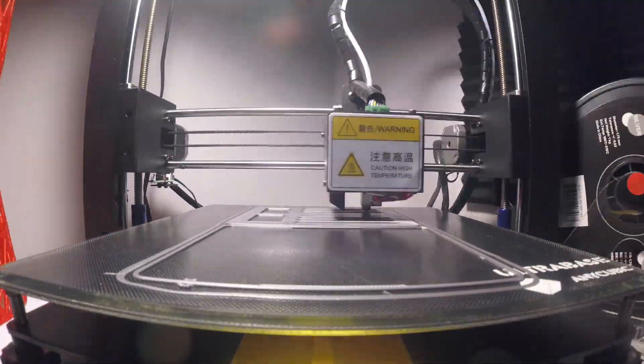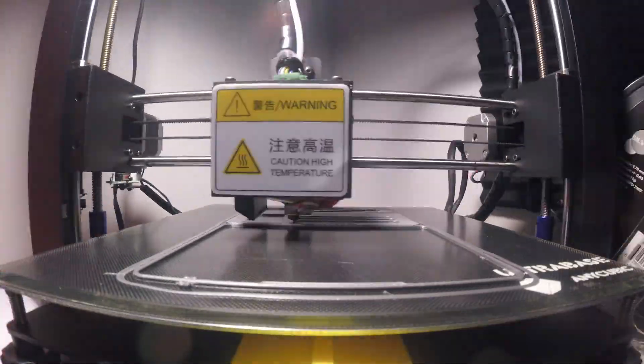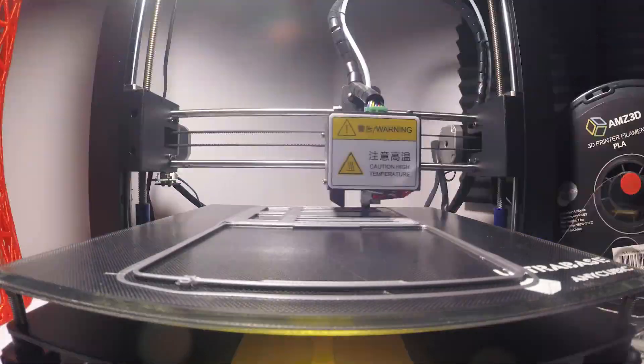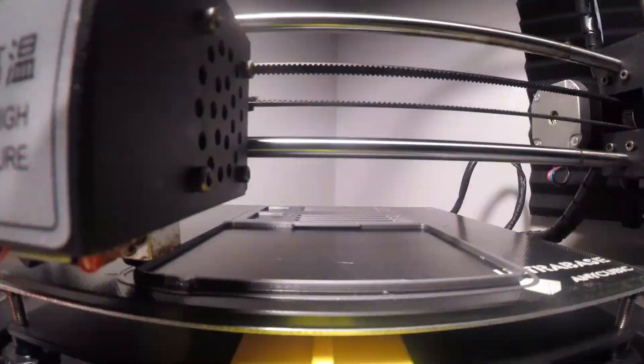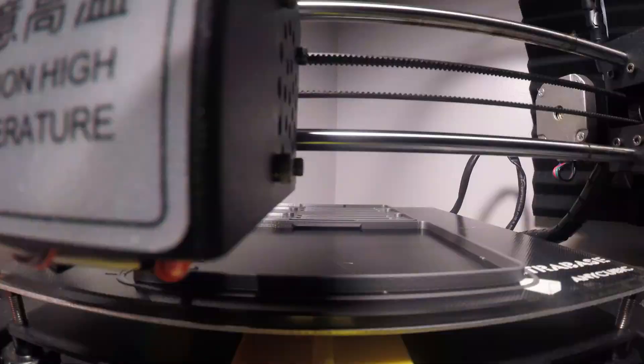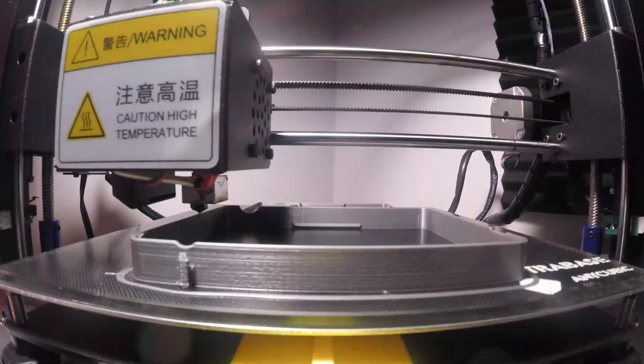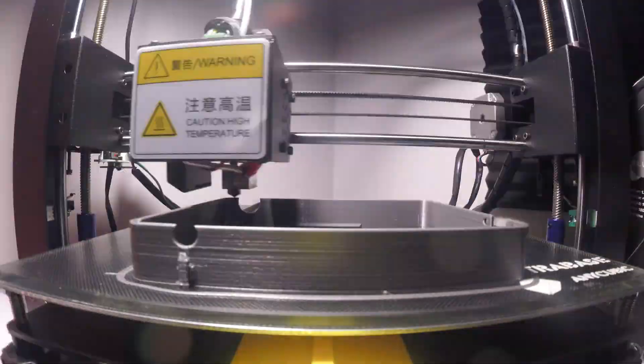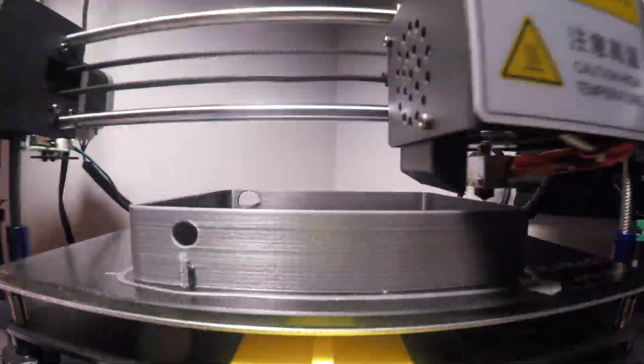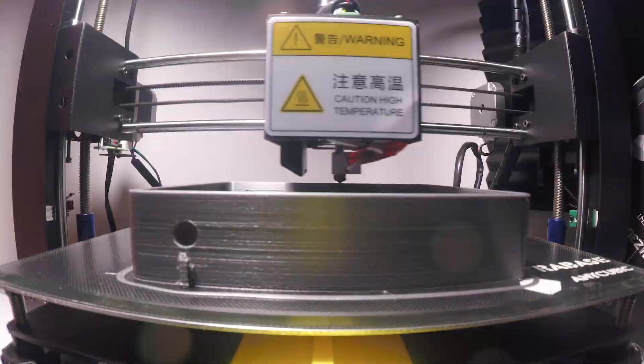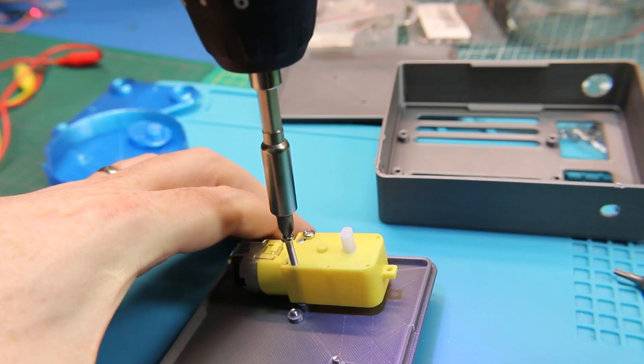Using the Anycubic i3 Mega 3D printer, I was able to fabricate all the parts I needed. The few parts I had to order, such as bearings and some screws and nuts, simple stuff.